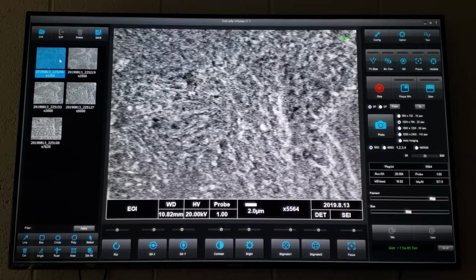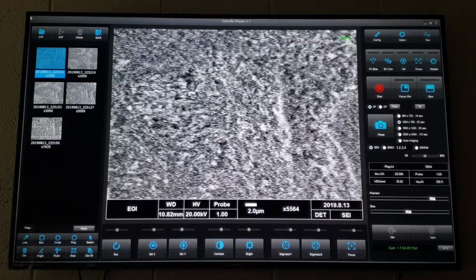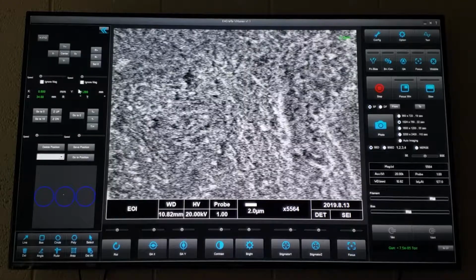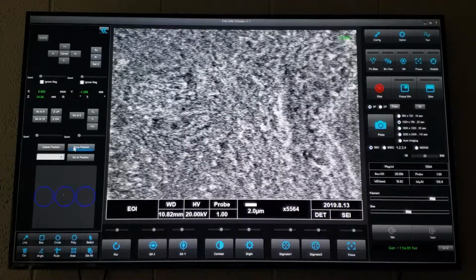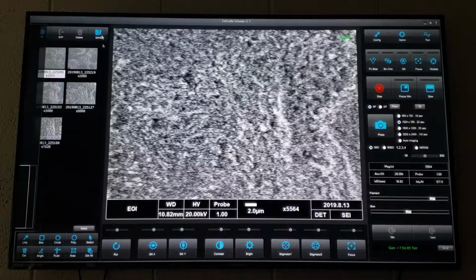And then we're back to our image collection, storage. And then if we hover our mouse, put it up in the corner, we get our stage program where we can home the stage and set coordinates and save positions and all sorts of good stuff like that. What did you hover your mouse over to get that? To get the stage, yeah.